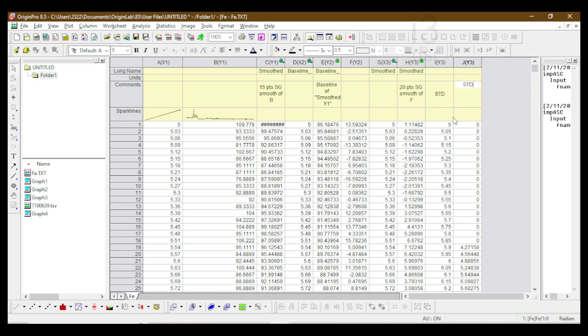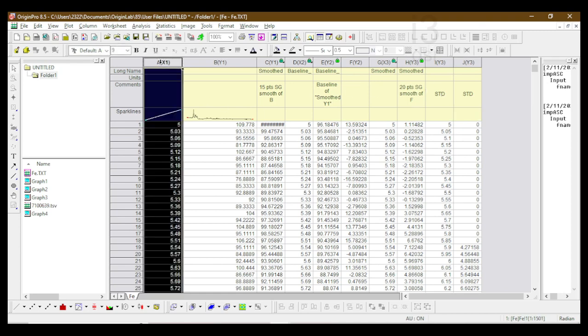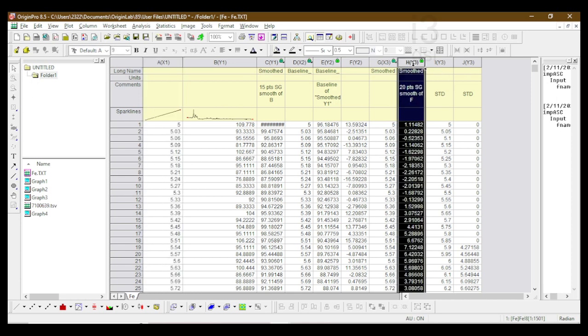Or you can also put as experimental, as calculated, or simulated, all these things. You have to plot this. So now what you have to do is all these should be y, because this is the final data which we are going to plot, and this is y3 and this is x1. So this will create a little confusion.